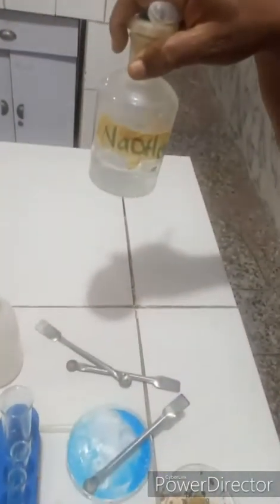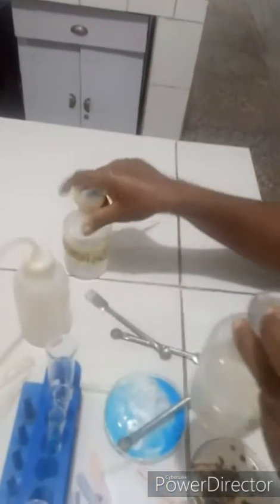There are 2 common reagents we use in identifying cations and anions. These reagents are precipitating agents. They precipitate insoluble metallic ions from their aqueous solution. They are sodium hydroxide solution and ammonium hydroxide solution, aqueous ammonia. So whenever we ask you to use them, we want to identify cations and anions.